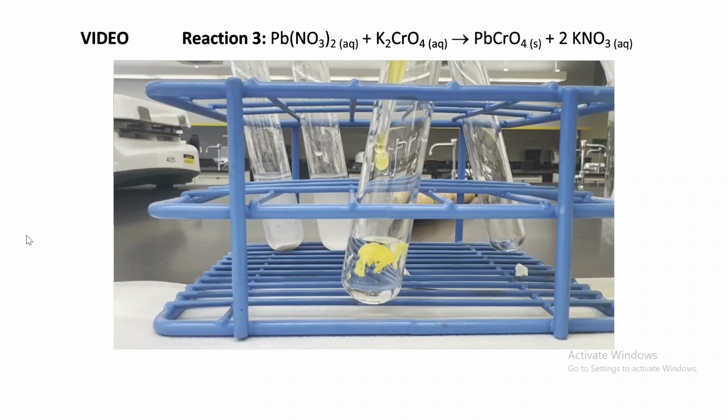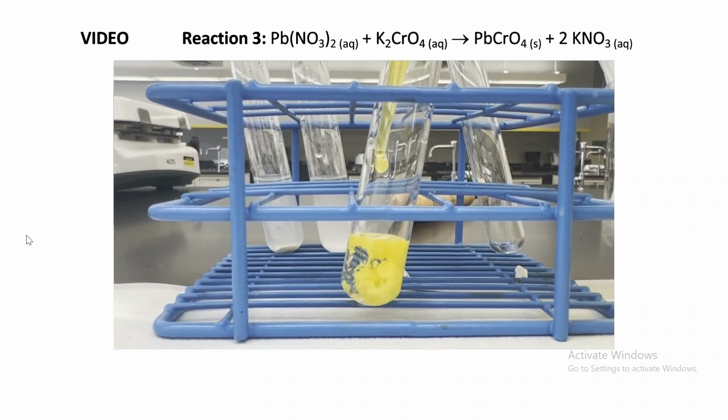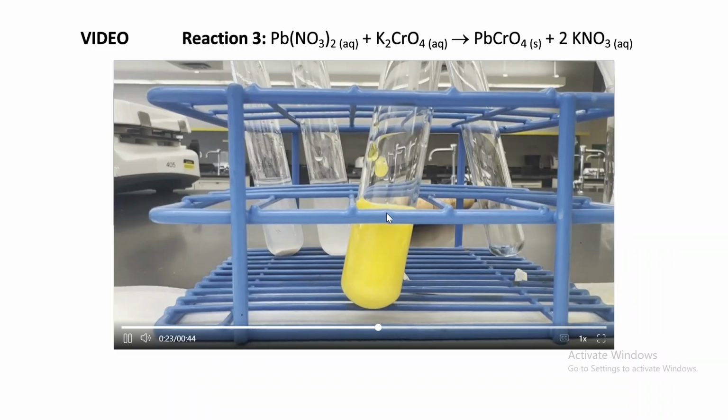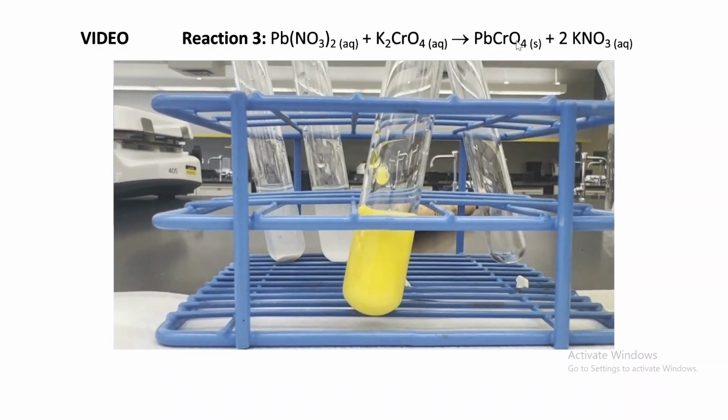Oh, look at what happened. Look at that piece of solid. This is, I would say, the best experiment so far. Look at that. Very nice. You can see now this is not a gas. This is not a liquid. This is actually a solid that we can filter. And this is the lead(II) chromate.